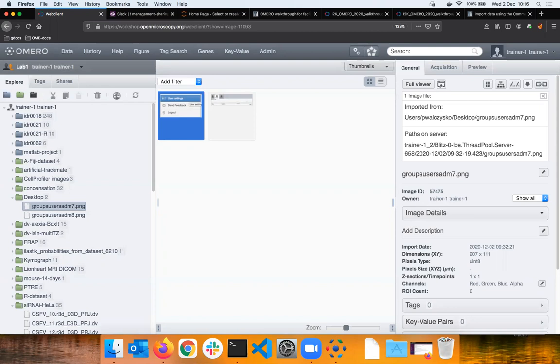What happens is that when the in-place import or an import happens, the metadata are read during the process, and those metadata are stored in the database. The original file stays as it is. We've been working on a mechanism to re-update the metadata, especially for that problem. Let's say we misread some metadata and we don't want to re-import.